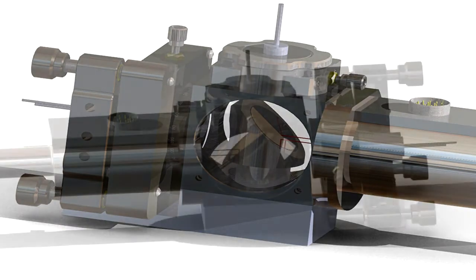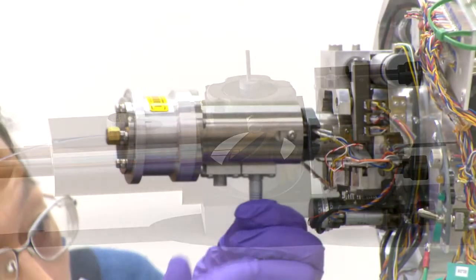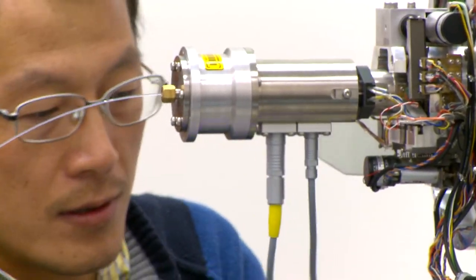The multimodal optical nanoprobe enables an unprecedented merger of electron microscopy with optical excitation and characterization techniques.